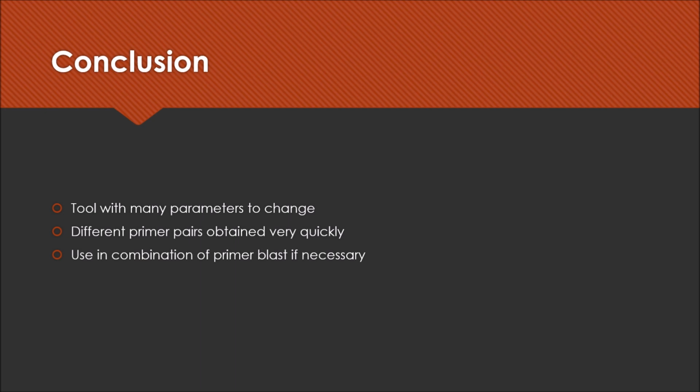And I think to use this program at its best, it's best if we use it in combination with primer blast to just see if it does not bind to any unintended targets. And we also see that the melting temperature is slightly different, so maybe that might be a problem later in the PCR also.